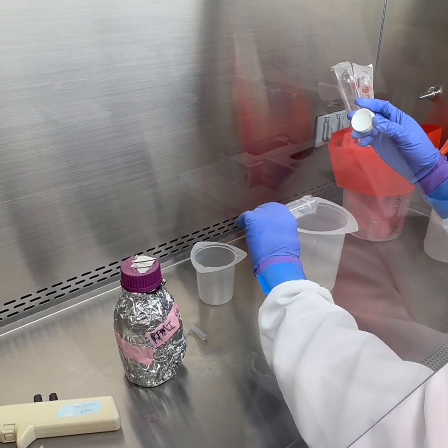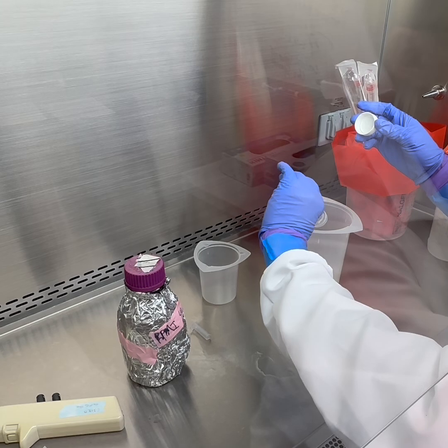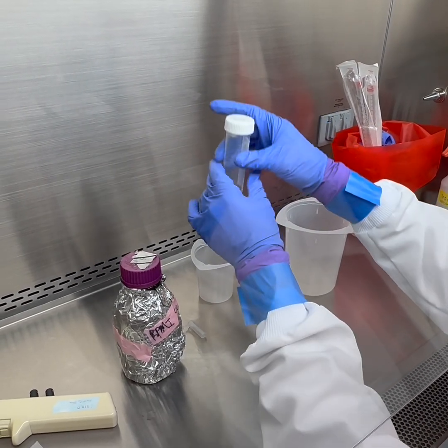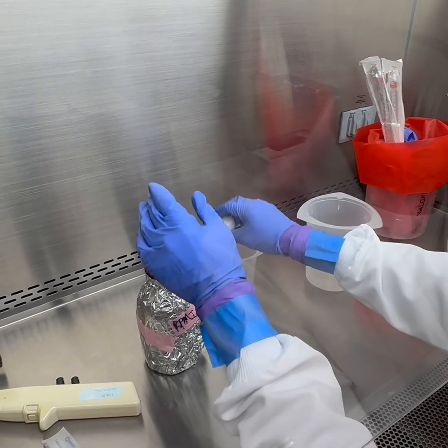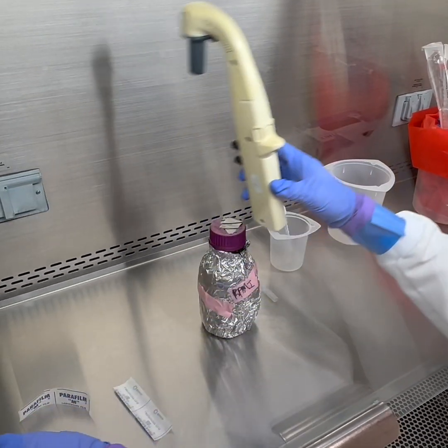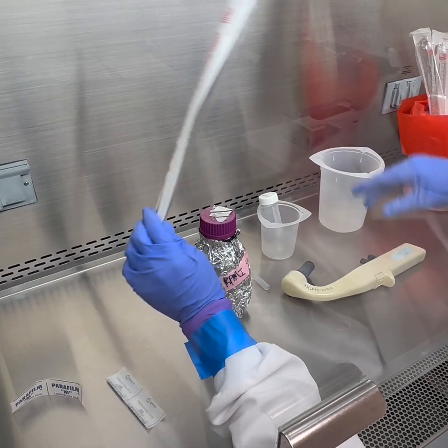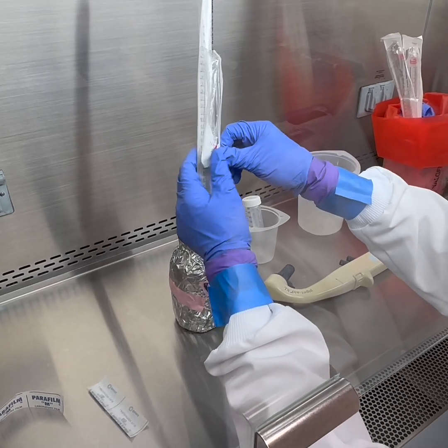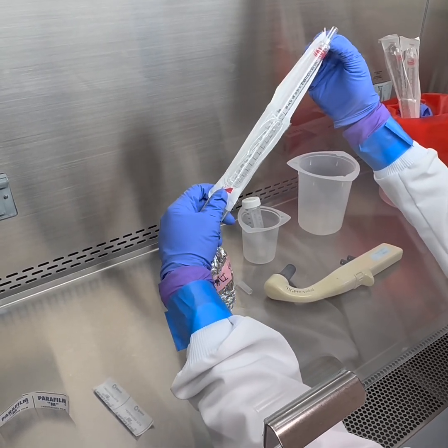I'm going to decant into the bleach. You see we still have a nice pellet here. And then you're going to add roughly somewhere between 20 and 40 milliliters of RPMI to resuspend.